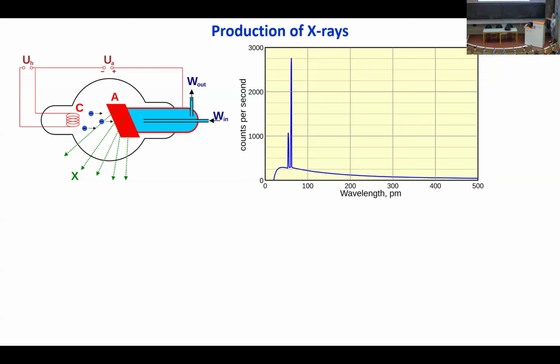In this case, this is rhodium, if I remember correctly. And you will have emission lines. You have a steady and almost continuous background, which is perhaps shallow, and you have typical lines, K alpha and K beta. And these are the lines we are actually using for X-ray diffraction.